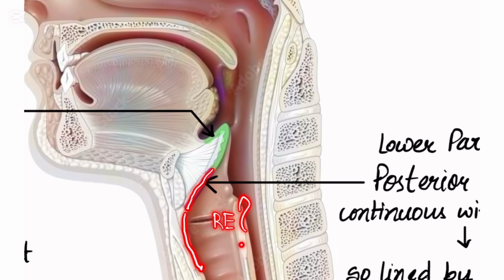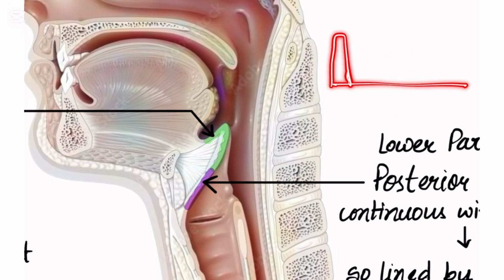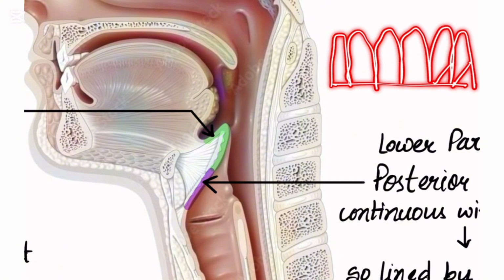Now, big question, what is respiratory epithelium? See, respiratory epithelium is going to be very significant throughout your respiratory system, and it is none other than pseudostratified ciliated columnar epithelium. The significance is that you have these tall columnar cells along with these small basal cells that are arranged in a single layer, but since nuclei are present in two different layers, it seems as if the cells are stratified or in two different layers. However, that is pseudo, or false.